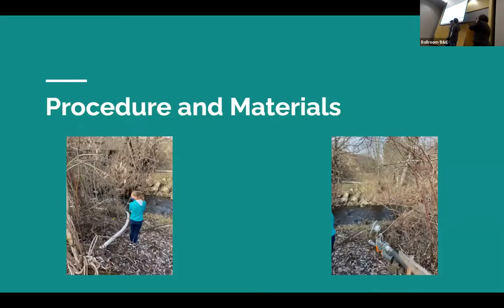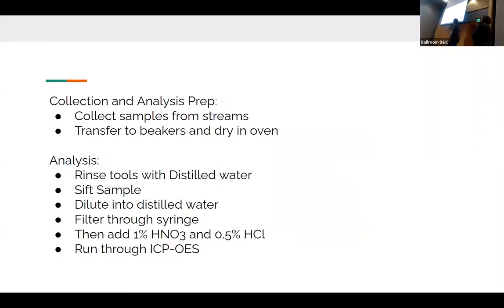So for our procedure and materials, we did a collection and analysis prep by labeling our bags and planning out a driving route to go to all the streams for our collection. We collected using the same procedure at each stream, where we put our hand in the outside of the plastic bag, turned it outside, and then grabbed a handful of sediment. Then we brought those back to the school, and we transferred them into beakers, which we rinsed with distilled water to keep from any contamination from occurring. And then we dried them in the oven. After that, we transferred them to new plastic bags and we labeled them.